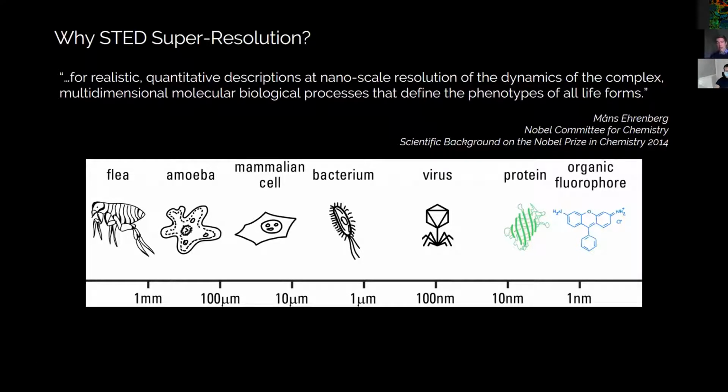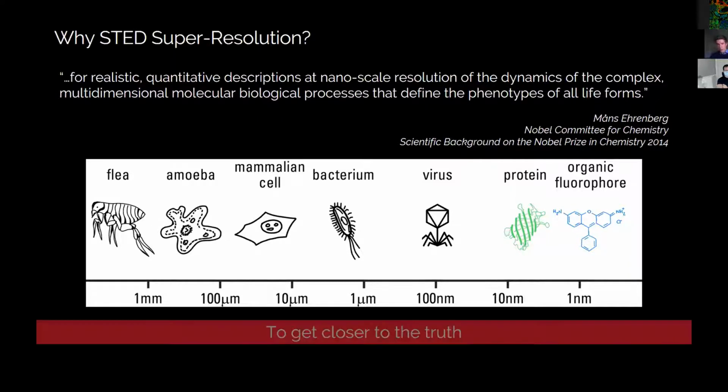And this is where FLIM now comes into play. If we combine FLIM microscopy together with STED, that allows us to lower the depletion laser powers at the same resolution, which makes it much more usable for live cell imaging. And that in turn is a closer situation to your real natural sample state, which gets you closer to the truth in your samples.